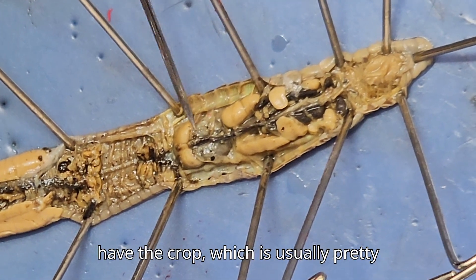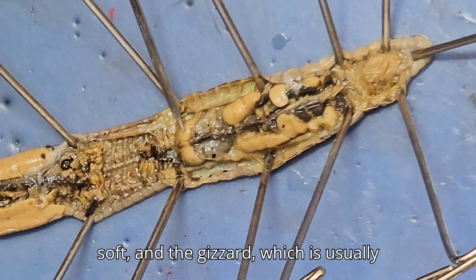Continuing with the digestive tract, we have the crop, which is usually pretty soft, and the gizzard, which is usually pretty hard.